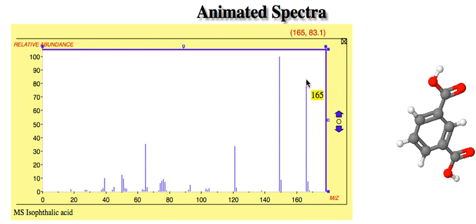Whereas this peak had an intensity of 83 units, you can see that up there, this one is down at about 7 units. So it's not 10% of it, and we don't have 10 carbons. We have 6, 7, 8 carbons. But that's one of the things you can tell by that ratio, is roughly how many carbons you have.